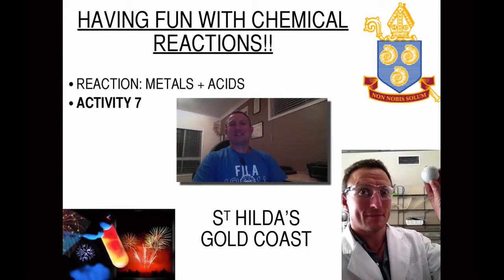Welcome to activity 7 of having fun with chemical reactions. In this reaction we're going to be looking at what happens when we mix metals with acids.